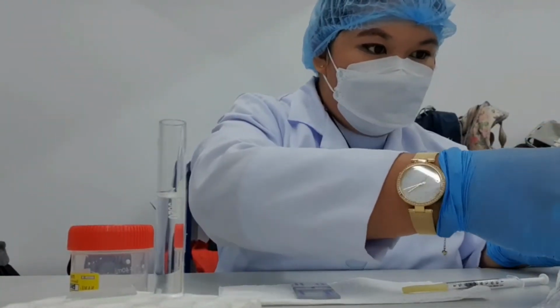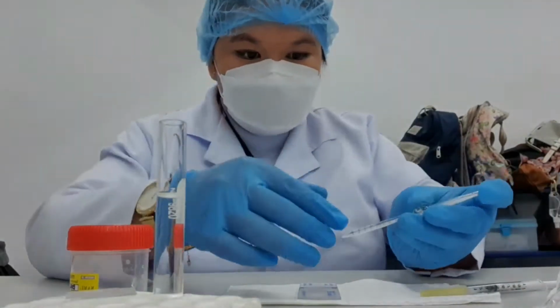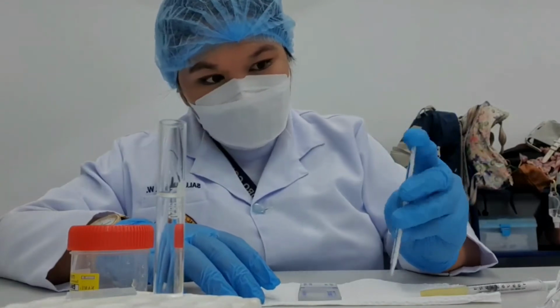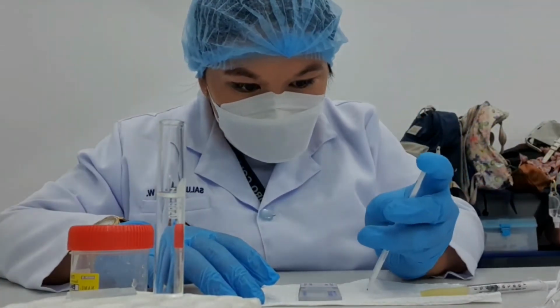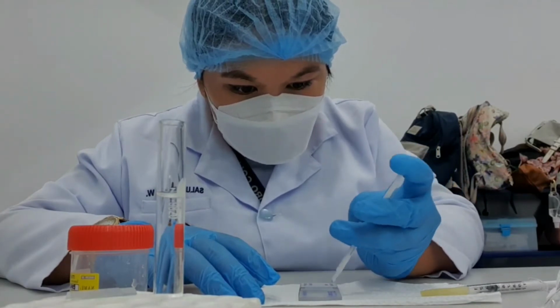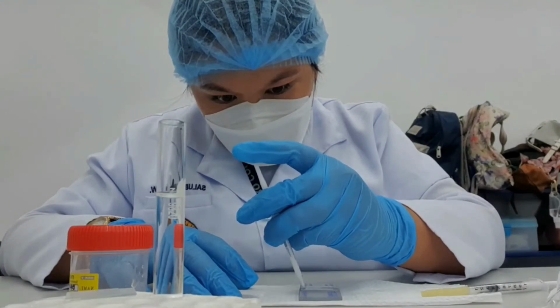Now, place a cover slip on top of the Neubauer slide. Discard 3 drops of the sample solution before charging the sample to the slide because the sample should be from the bulb of the pipette. After discarding, carefully charge the sample on the sides of the slide and leave it for a minute.